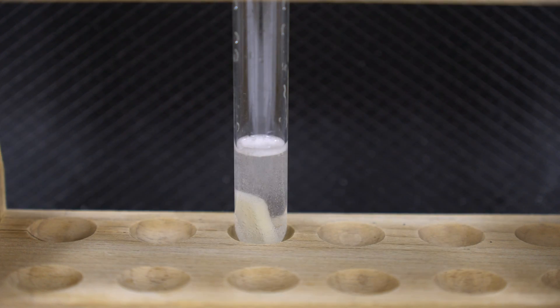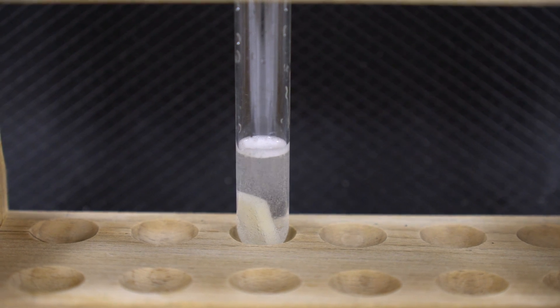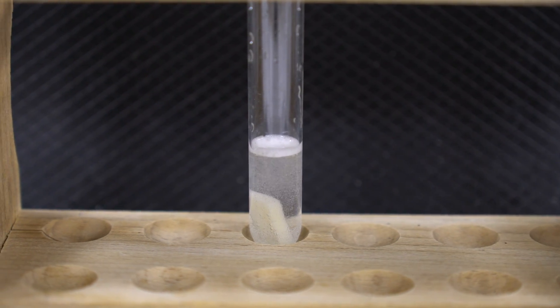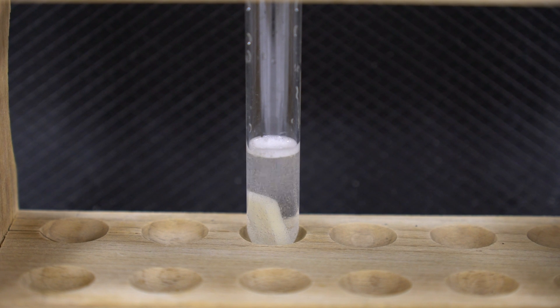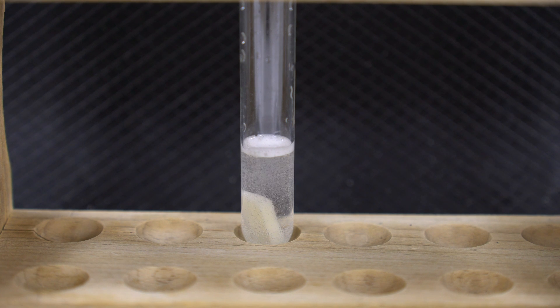Seeing that slow release there, seeing the concentration of those bubbles forming at the top. Again, this is just a regular potato and 3% hydrogen peroxide.